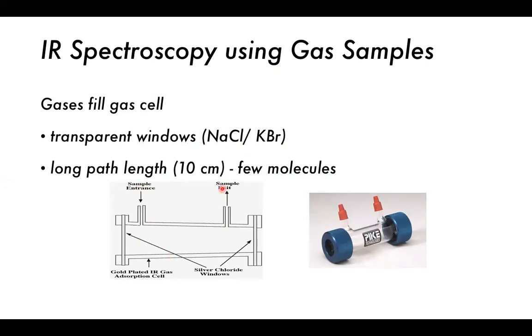For example, say we were doing a reaction and we wanted to monitor it as it was going on. This is possible with FTIR because of how fast it passes through. Say we were reacting an unsaturated hydrocarbon with hydrogen gas over a platinum metal.